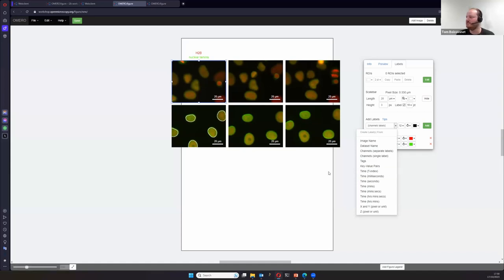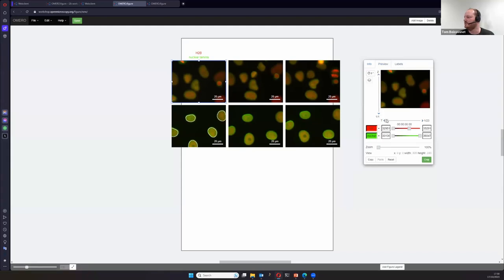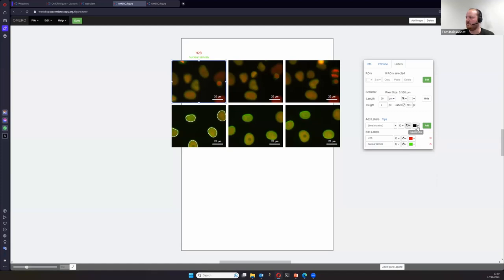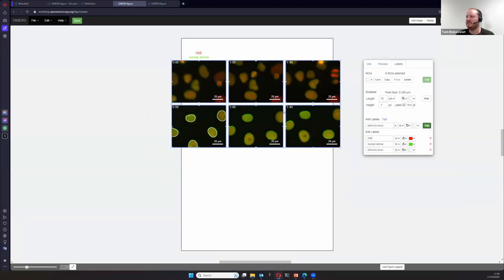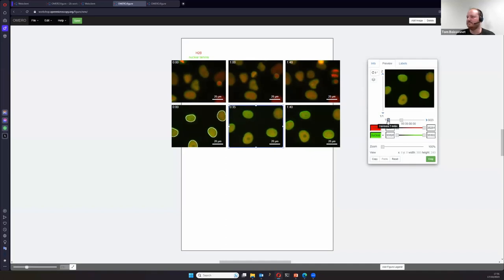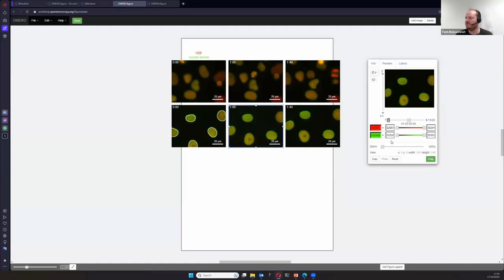We also have tags or key-value pairs — since we're playing with the time of the images, we could use the time format: time in hours and minutes. Position it in the top left corner, make it white, and add it for all images at the same time. OMERO Figure will read for every panel what is the currently selected frame and display the time accordingly. If I change the time point, the time label changes as well. The same applies for X, Y, Z axis if you want to show the depth of your plane.